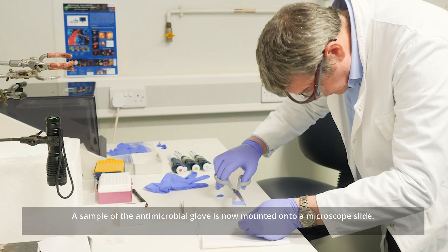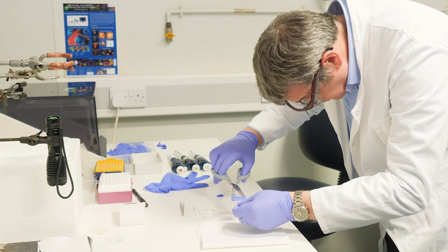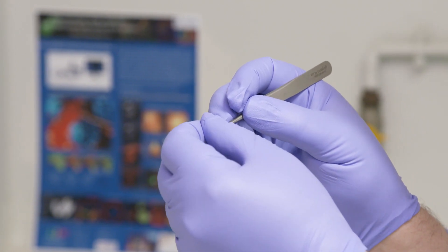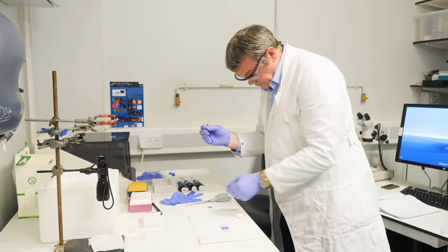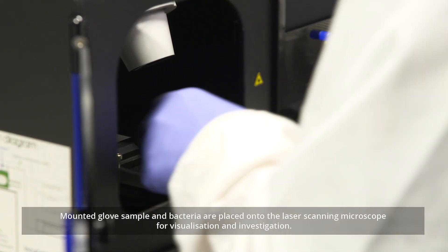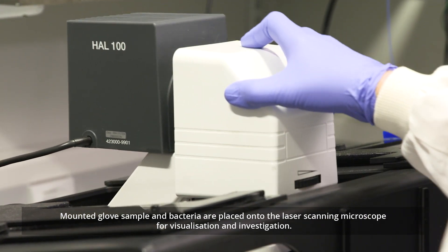A sample of the antimicrobial glove is now mounted onto a microscopic slide. The mounted glove sample and bacteria are placed onto the laser scanning microscope for visualization and investigation.